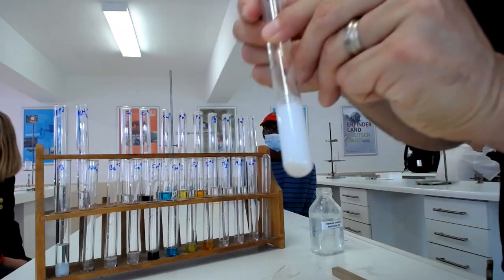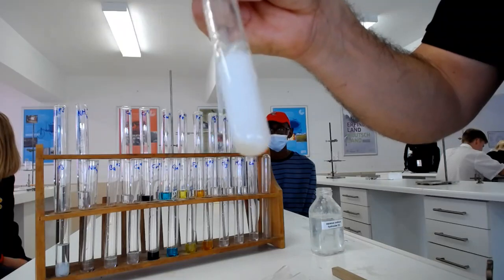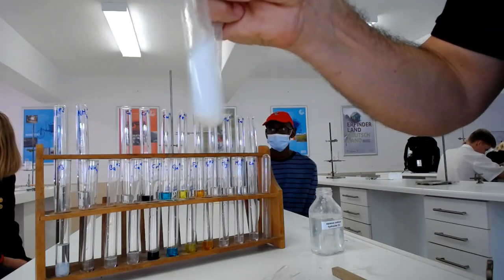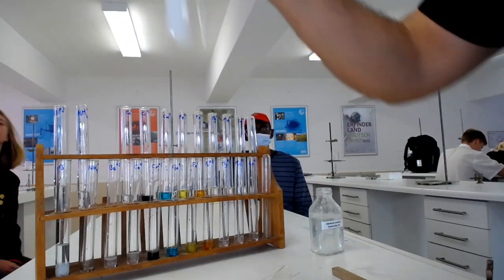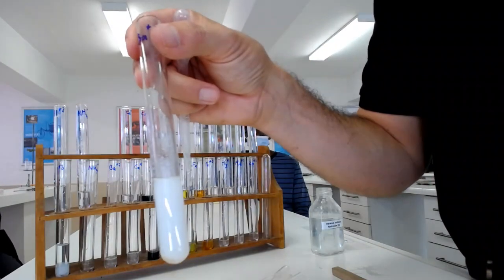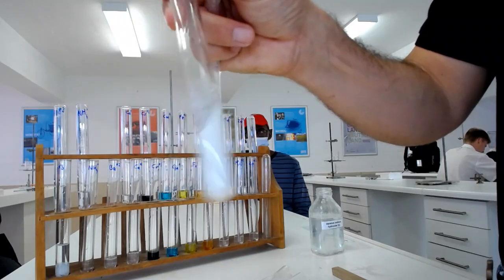It says a faint white precipitate is nearly always observed unless the reagents are pure. So there's my white precipitate, and it stays. With barium, it's there, right? It's not going to dissolve.